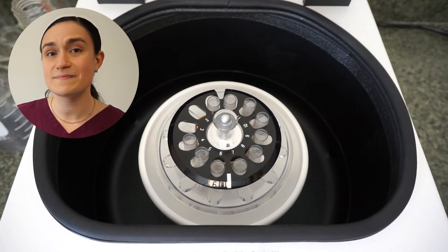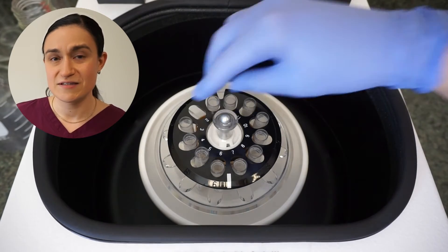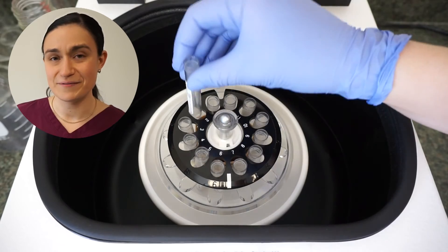And finally, if you're spinning 12 tubes, you'll simply load one into each slot on your rotor.